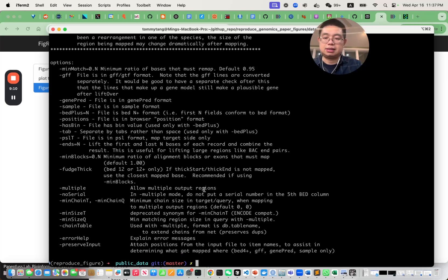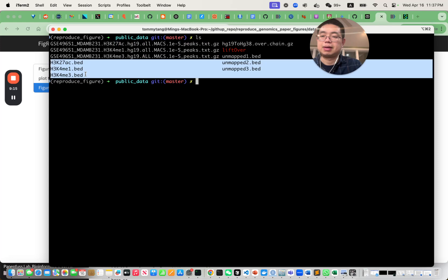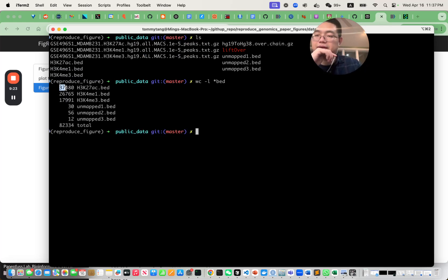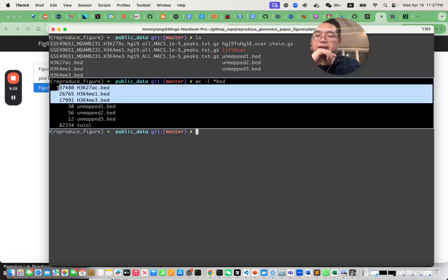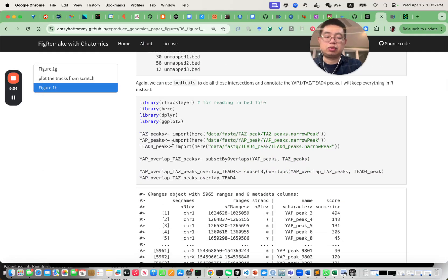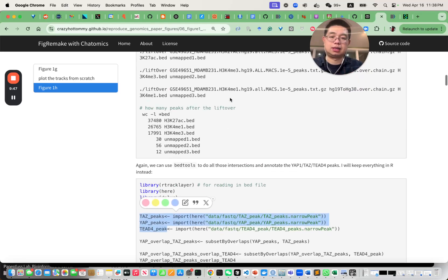After doing that, you end up with three BED files and three unmapped files. You can check how many lines there are: roughly 37k, 26k, and 18k peaks for each of the three histone marks. We already called peaks for those three transcription factors, and you can use bedtools intersect to find overlaps.